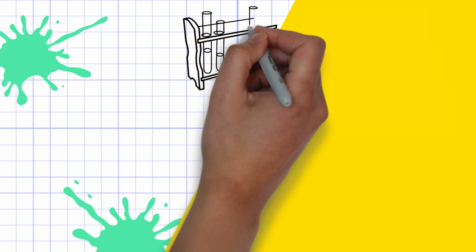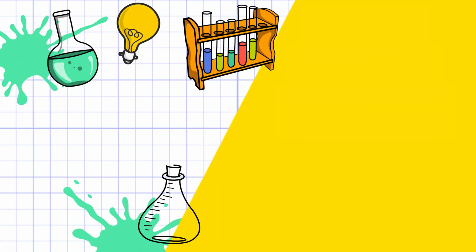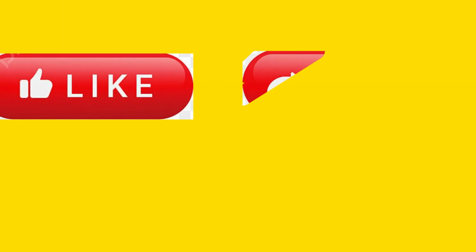In conclusion, both the Benedict test and the starch test play crucial roles in biochemical analysis, allowing us to identify the presence or absence of specific compounds in various substances, aiding industries, research, and diagnostics.